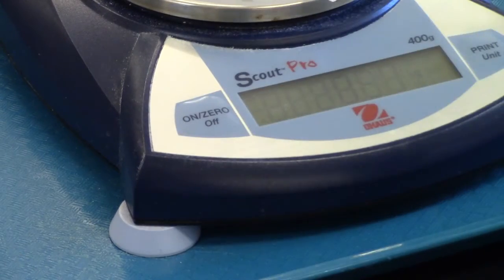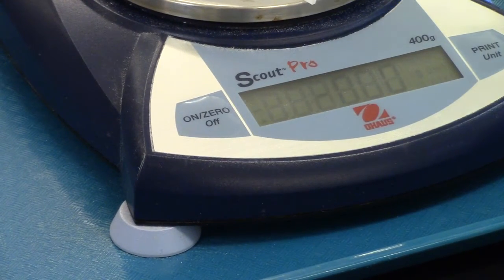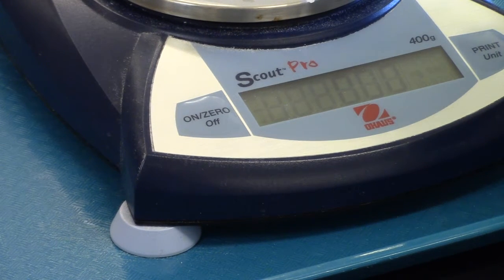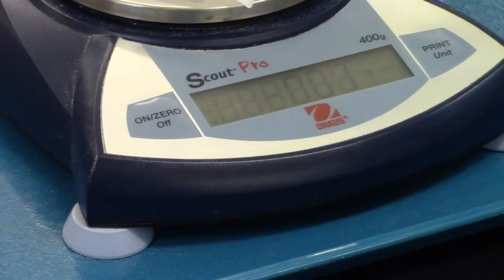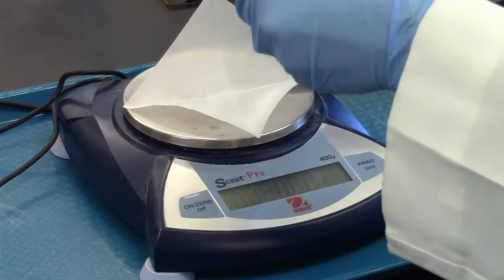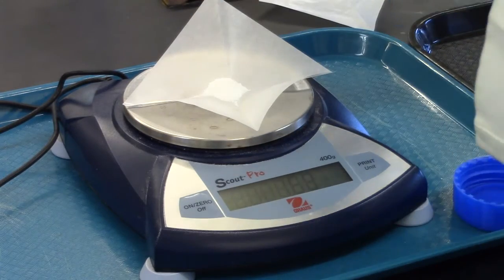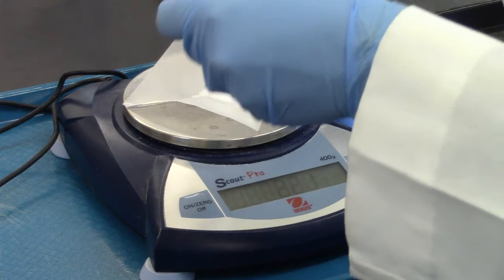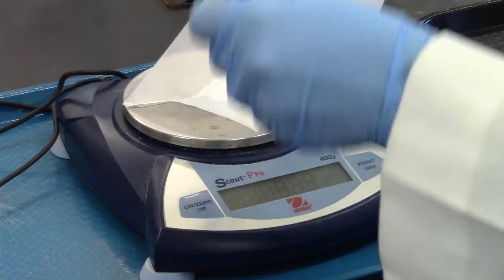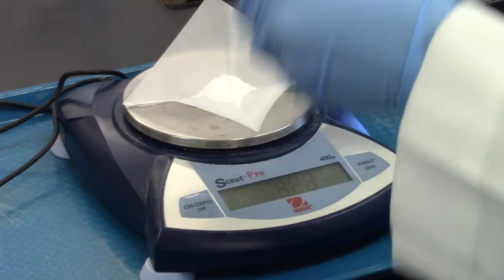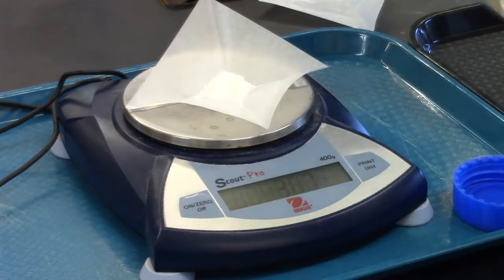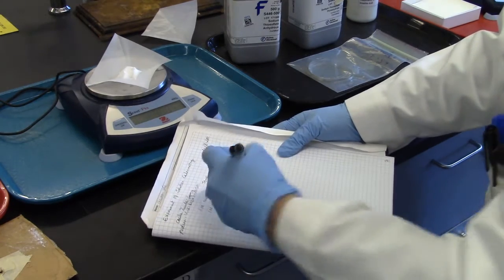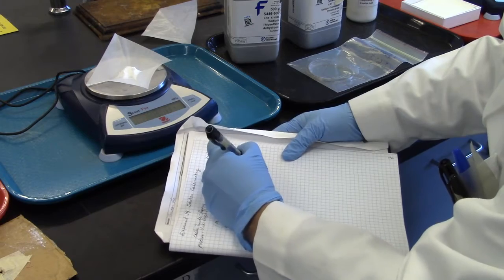The weighing paper has been placed on the balance. Now she will tare out the weighing paper, setting the balance back to zero. This way she can get the three grams of sodium thiosulfate anhydrous that she will need for the experiment. Record the mass into the notebook.